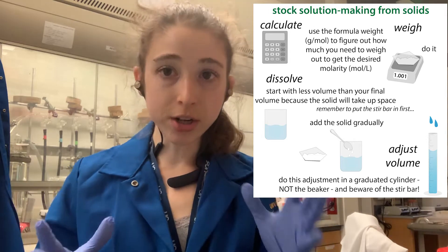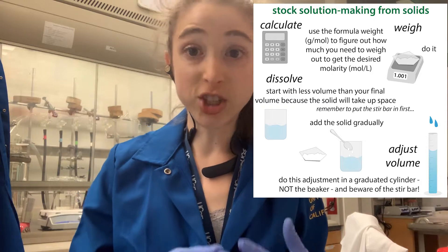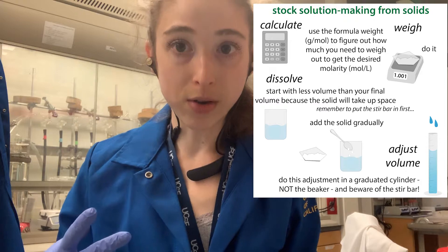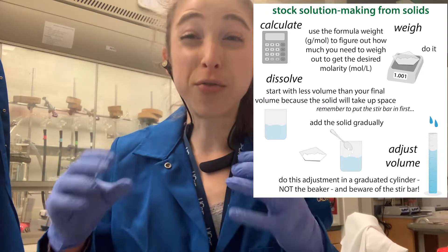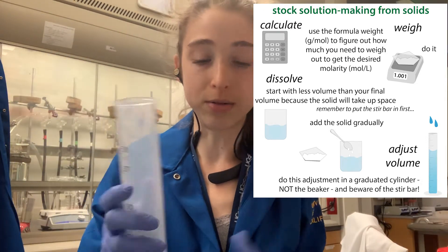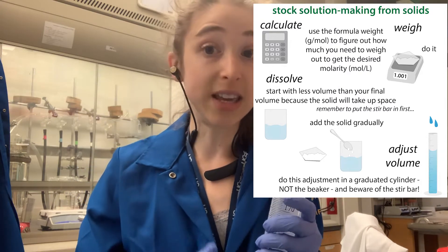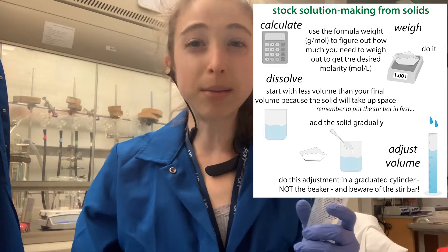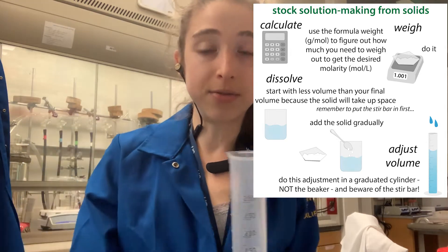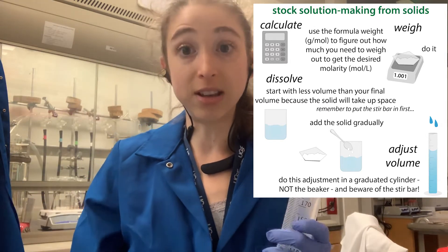When you're making a solution, you weigh out how much you need, and once you've weighed out how much you need for a given volume, you're going to dissolve it in the liquid to make it to that final volume. So say you want to make a liter, or 250 or 200 mils of solution — that's your final volume. You have to take into account the volume of anything you add. If you add a whole bunch of solids, that adds bulk, and that's going to displace liquid.